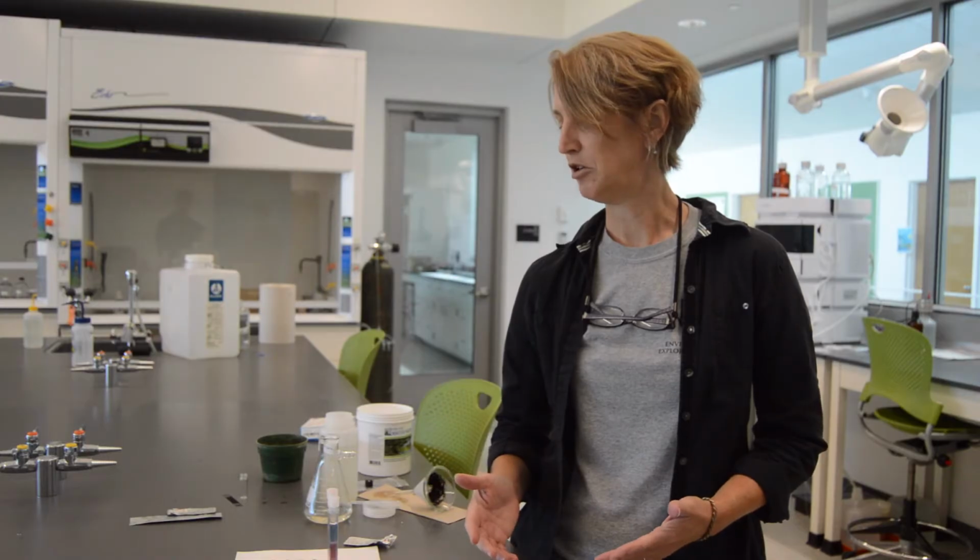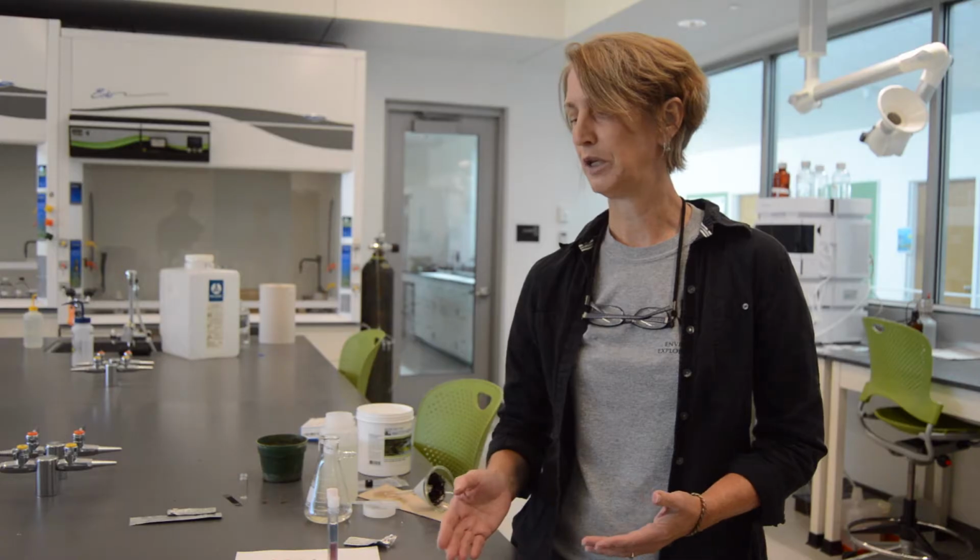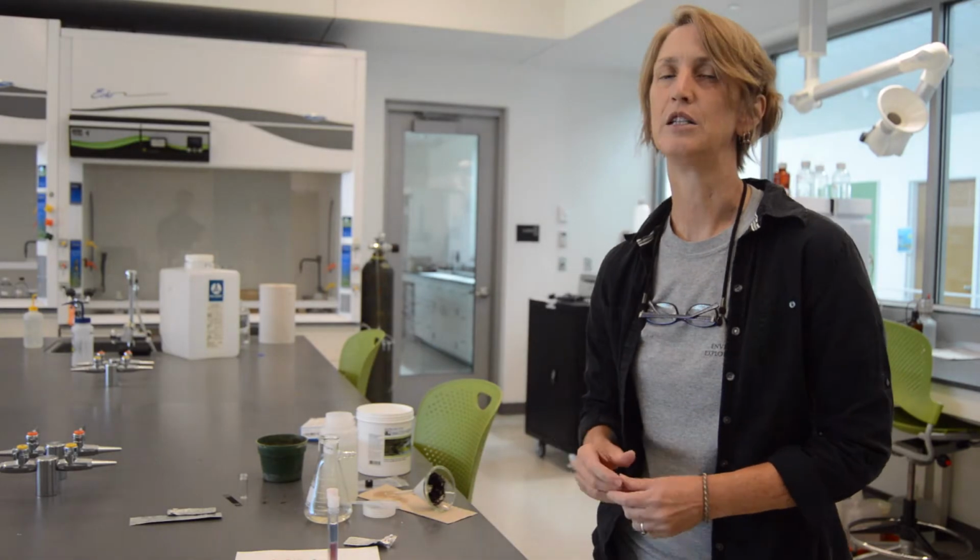Because due to runoff and some other sources, we can actually end up with high nutrient levels, which is bad for the ecosystem, and can actually reach hazardous levels. So I'm going to demonstrate the use of some water monitoring tests that come in a very simple, portable sample kit. So you can take these out, collect your water samples, and they're really straightforward tests. Most things are prepackaged in pill form, and so they're very convenient, and the results are really easy to interpret.